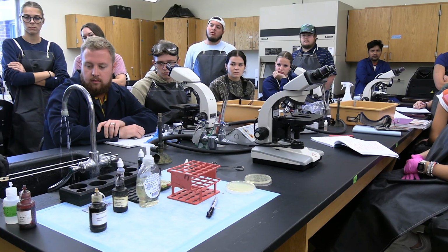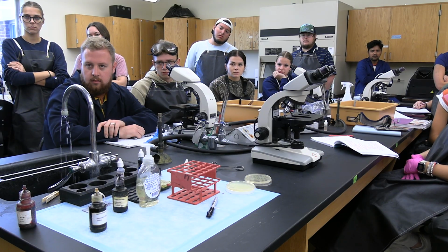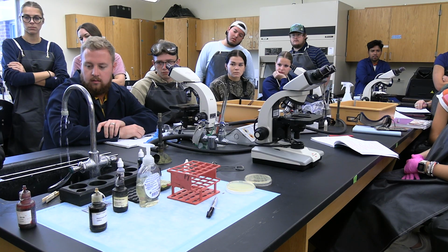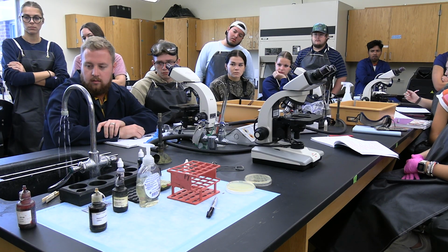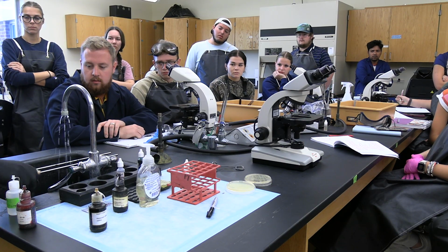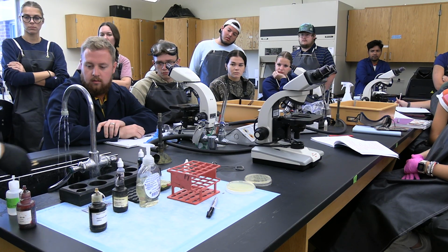Okay, the next step is important. It is 70% alcohol for decoloration for 10 seconds. So we just put it there. We're going to count 10 Mississippi, and let's say it's ready. So you're going to rinse it.